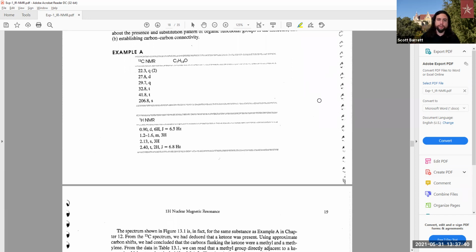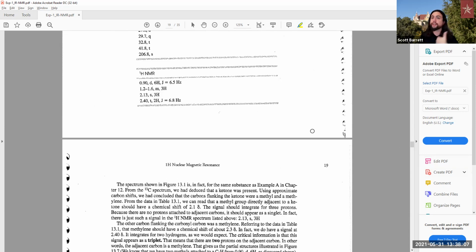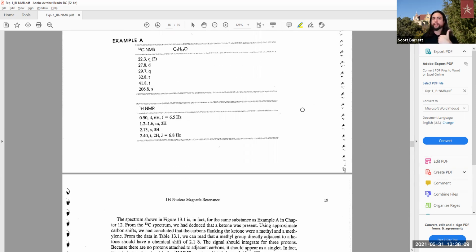Okay, and so going forward, this is a good example. It's a little hard to follow because you're going to have to jump back and forth, but I'm going to slightly go through this. I definitely recommend, as we did before with the IR spectra, since this is older information, look up some NMRs of common compounds, and then you'll be able to look at the specific peaks and find those specific protons attached to the specific carbons. That way you'll understand not only the locations, but the multiplicity and then the integration factors. And then it'll all tie in together because they're all related.